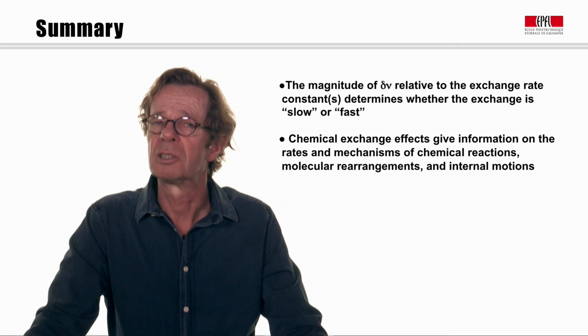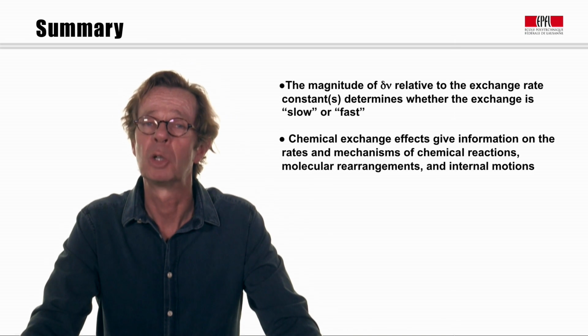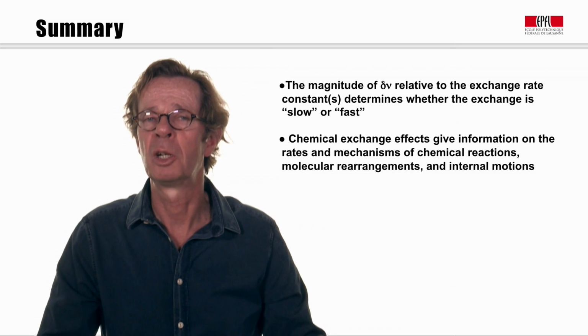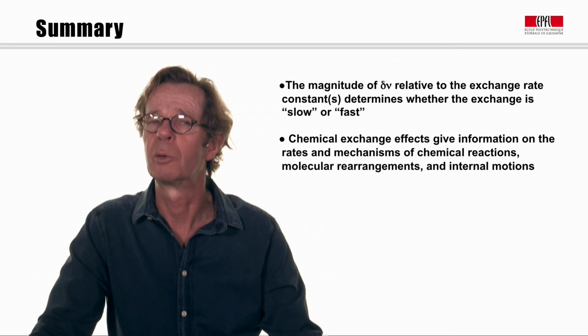Chemical exchange is probably one of the subjects that will live for many years to come. There is currently much attention paid to chemical exchange in proteins and also in DNA, for it has been found that the well-known double helix is not as static as it appears, and that in fact there are many exchange processes that are worth studying in large biomolecules.